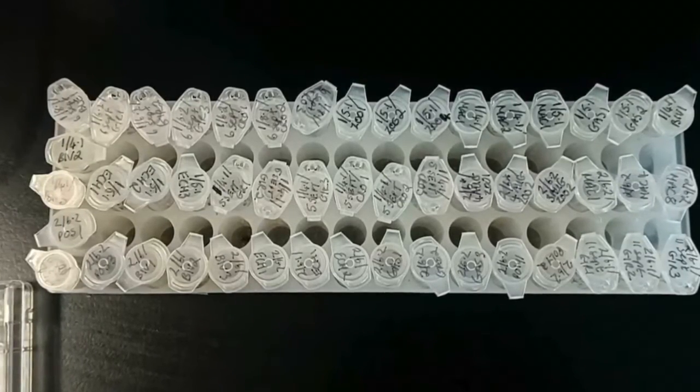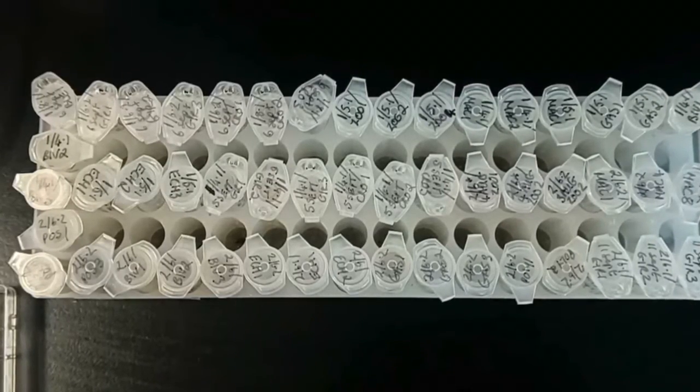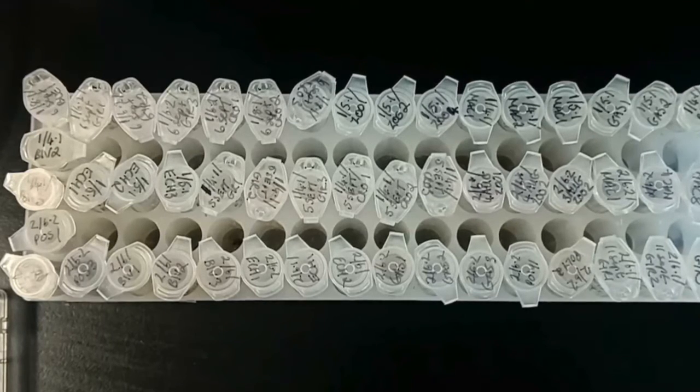For our project, examples of primary producers include things like Makaragi. The reason for having the larger sample for primary producers is that the stable isotopes are present in lower amounts, so we need a larger sample to get a big enough signal.